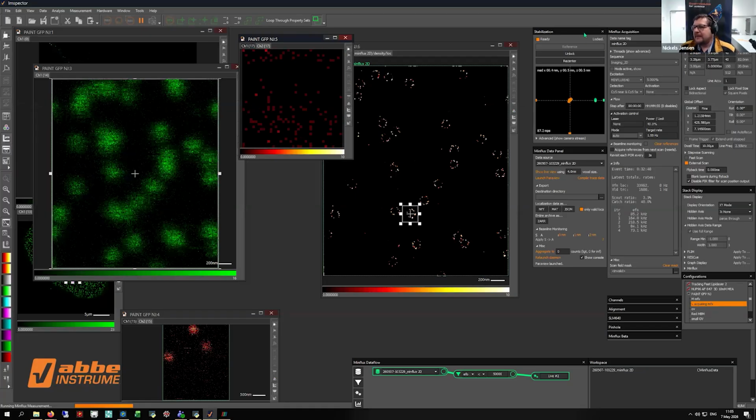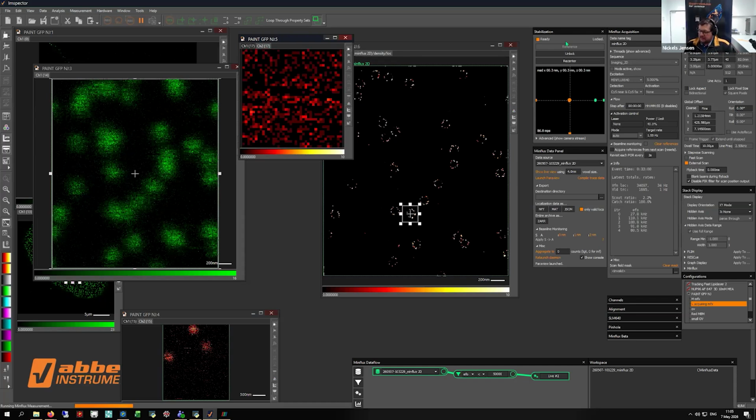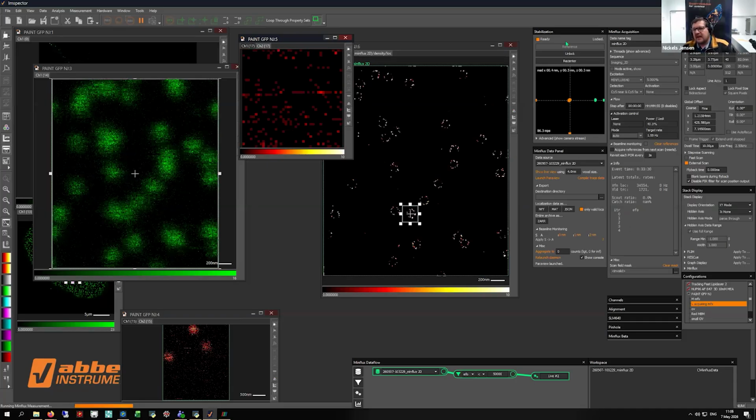And for this, we have a special stabilization. We use fiducials, gold beads, that we add to the sample after we stained the sample, after everything is done. We just add the gold beads to the sample, they stick to the ground, and we use a camera to detect the gold beads in an additional beam path with a 980 laser and measure the changes. And if there's a change in position of the gold beads or in the reflection pattern, we directly correct this with the piezos that we have at the system. This is done every 10 milliseconds, roundabout, in this case, every 12.